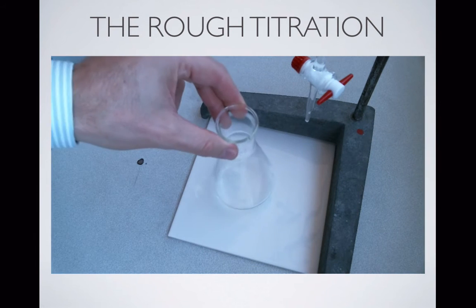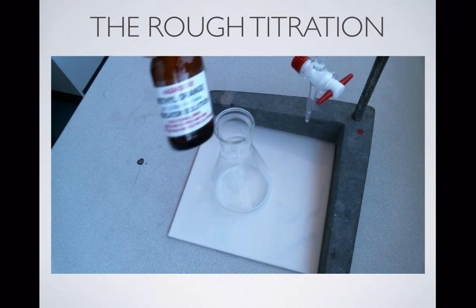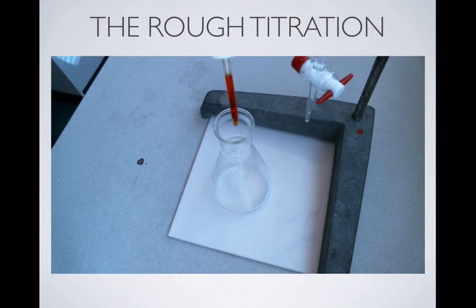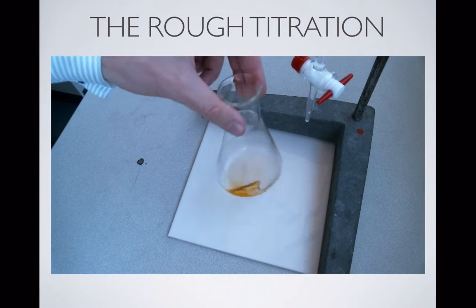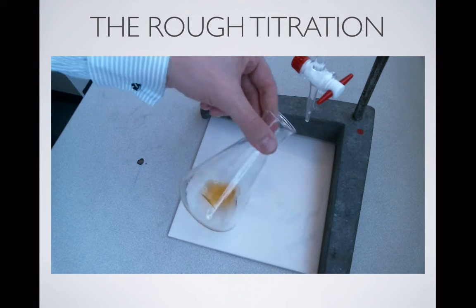Okay, so here's our flask with the aliquot in. This is actually sodium carbonate. We're using methyl orange as our indicator. There's other indicators we could use, but we're just going to add a few drops of indicator. Whichever indicator it is we're using, you don't need more than a few drops. Give the flask a bit of a swirl so that everything's well mixed and we'll pop that underneath our burette.